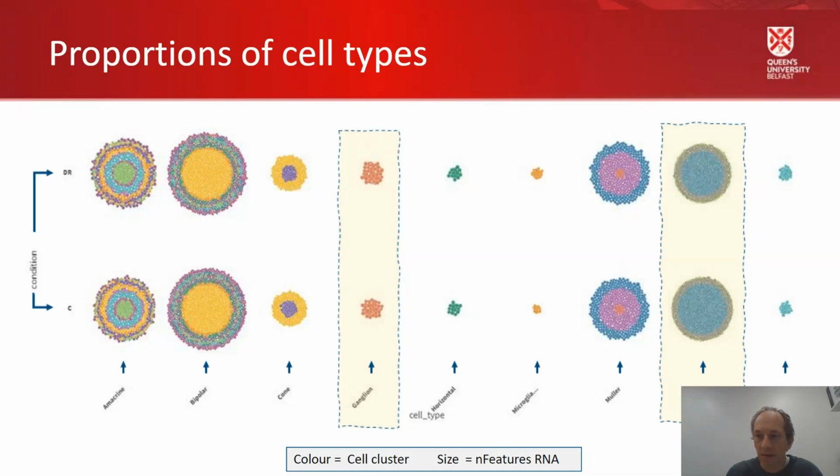So in the rod cells that we see highlighted on the right, they're very small dots, because these cells are, in the cell body anyway, very small, and also they express a small range of genes, but to a very high expression level, whereas the ganglion cells that are outlined there, each individual spot is bigger because they're larger cells with a wider range of genes expressed. This is just reminding you there's extra information available from single-cell RNA-Seq data that you can look into.